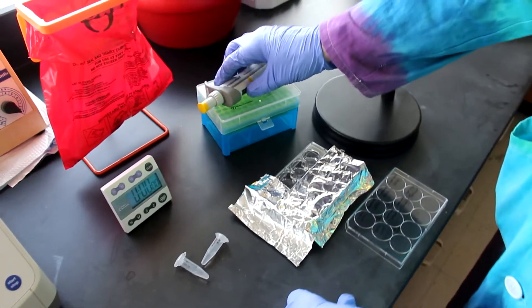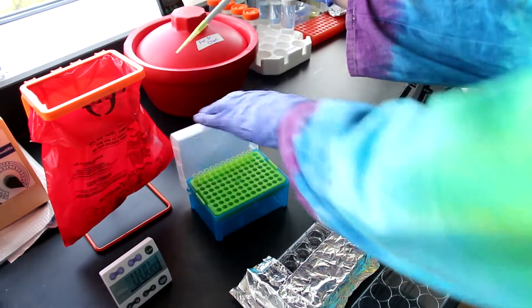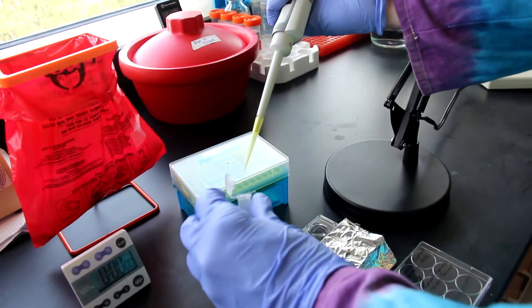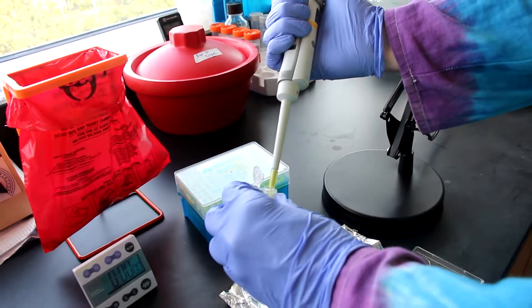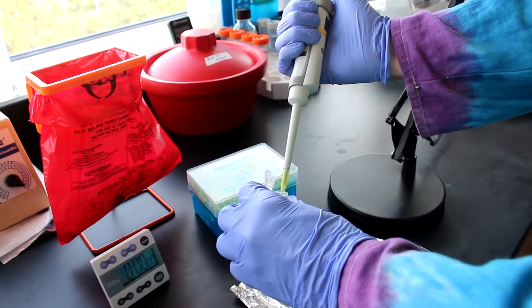When you're ready, again with a P20 pipette, quickly add 20 microliters of vehicle to each well, wait five seconds, and then photoconvert for a minute.